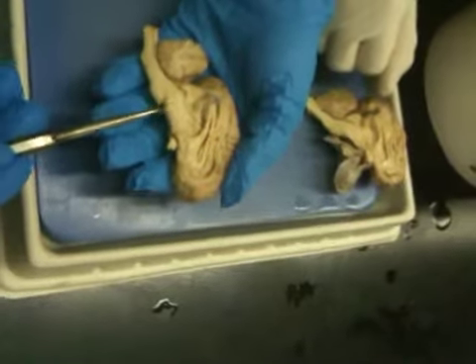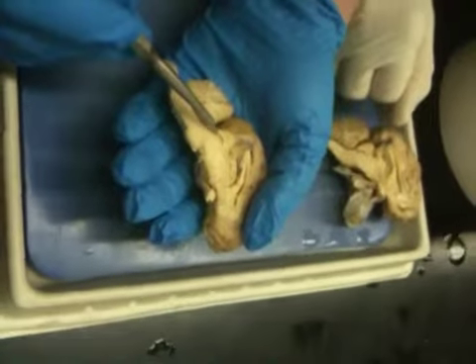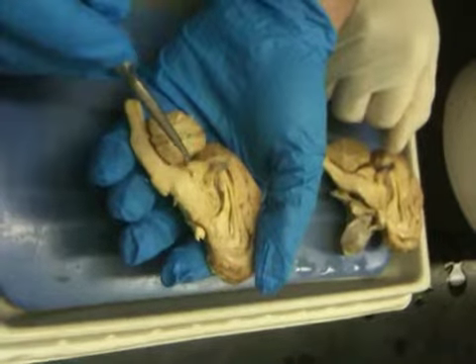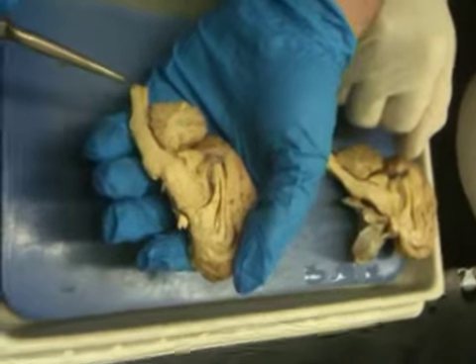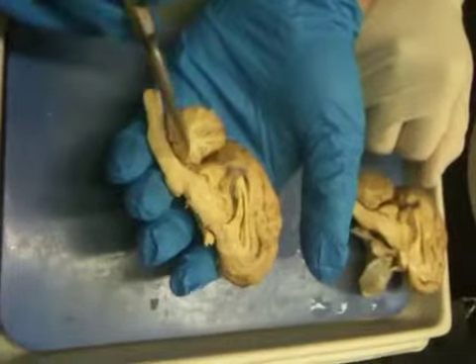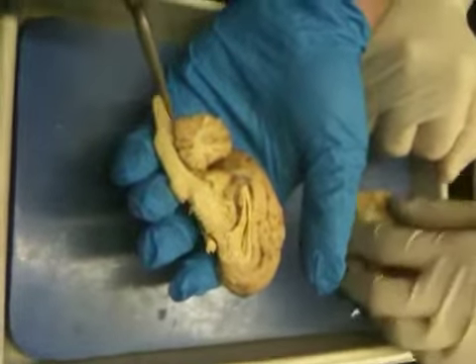Then we go with the aqueduct, which is this little fissure right here. If this is the caudal colliculi, there's this other body here, which you don't need to know, and then there's the aqueduct. And then we enter into the metencephalon. This is the whole cerebellum, right above the medulla oblongata.